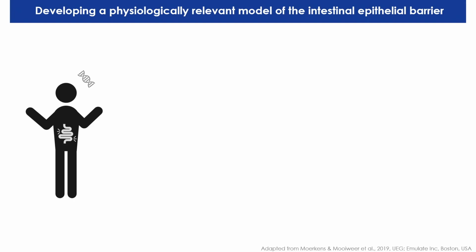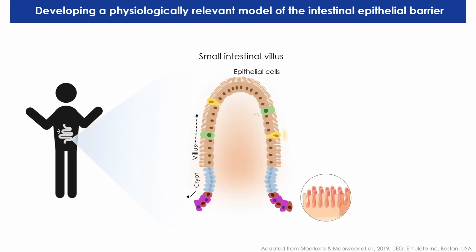In our lab we study complex intestinal diseases that have a genetic component. Our main focus is celiac disease, which is an intolerance to gluten. And in order to study these intestinal diseases, we need model systems that are able to capture the complexity of the intestine. So a very short recap of a few key principles that are interesting for this presentation.